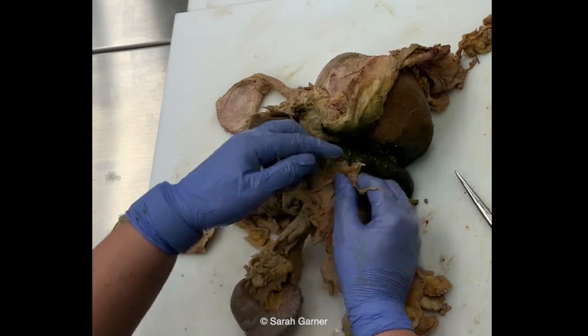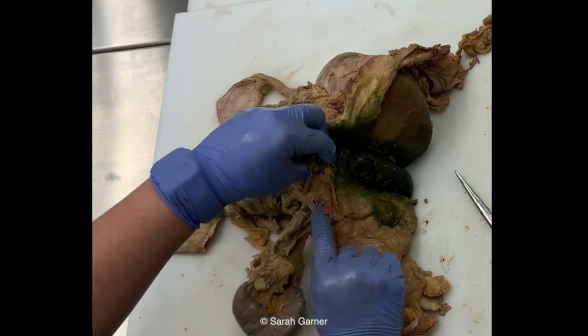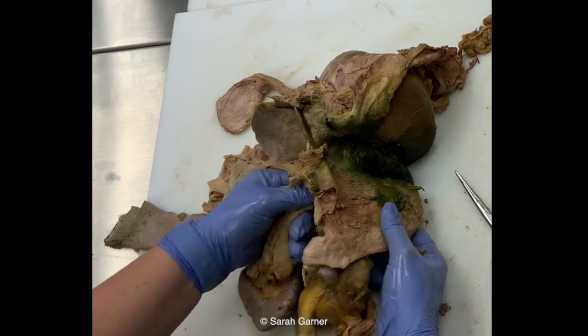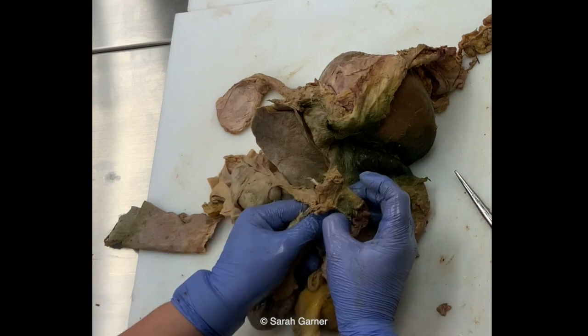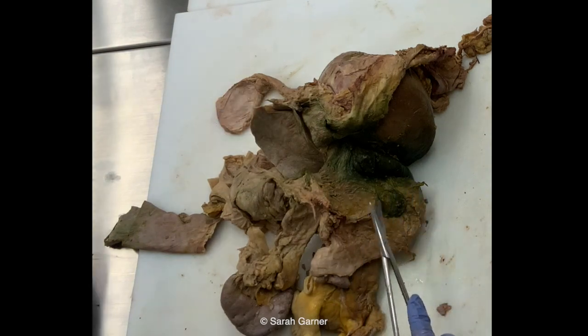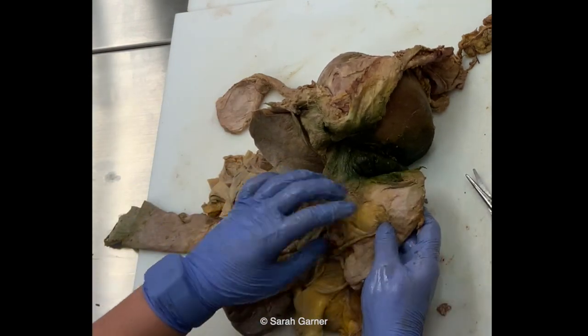So what is this big vessel here? Remember, that's going to be our superior mesenteric vessels. Those are going to sit right here, right behind the neck of the pancreas. So the head of the pancreas is more anterior here. This is where my thumb is in here. That's the neck, body, tail. So that's just a remnant of the superior mesenteric vessels. So unless you have some reason that you need to keep those intact, you can remove those, and you should open them and look inside too, just in case.